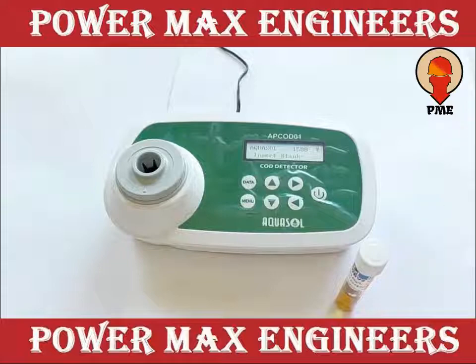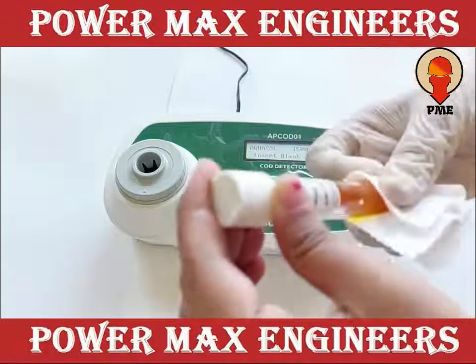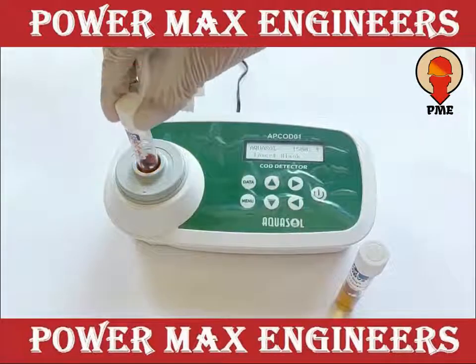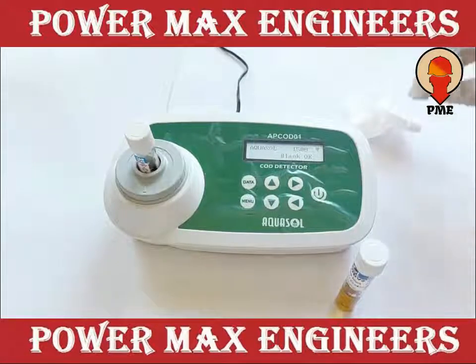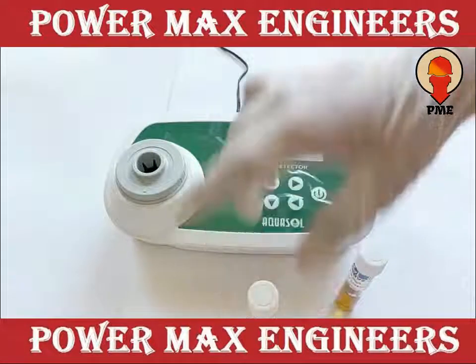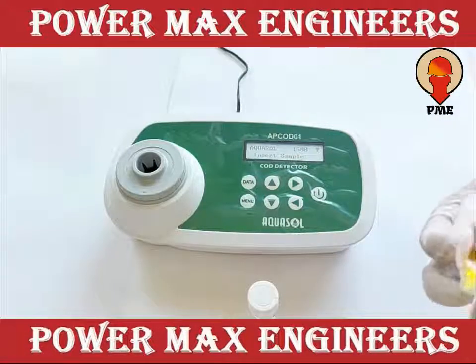Wipe the vials with tissue paper and insert the blank vial into the holder. A blank OK message will appear within 2 seconds. Pull out the blank vial and insert the sample vial and read the COD value in mg per litre.